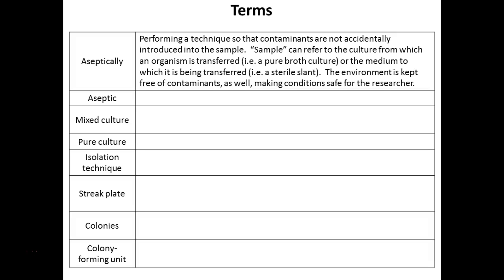Okay, so we don't want to contaminate your culture either, right? We want to keep what your culture is pure, which was the bonus term on the quiz today, right? Pure culture. And so what does that mean? Oh, it means you got a 10 out of 10 on your quiz today? You're happy. A single species of organism, right?